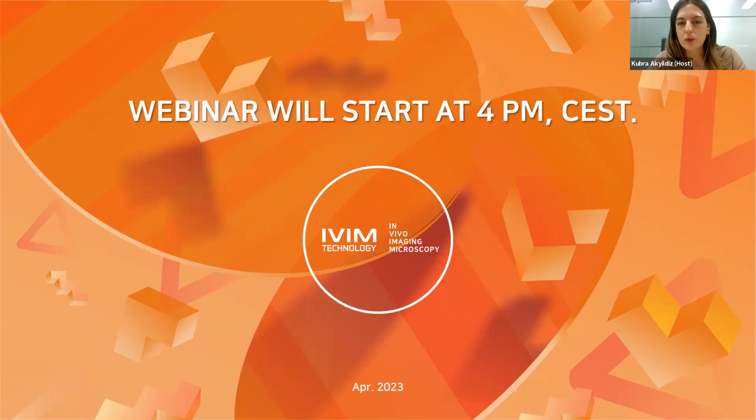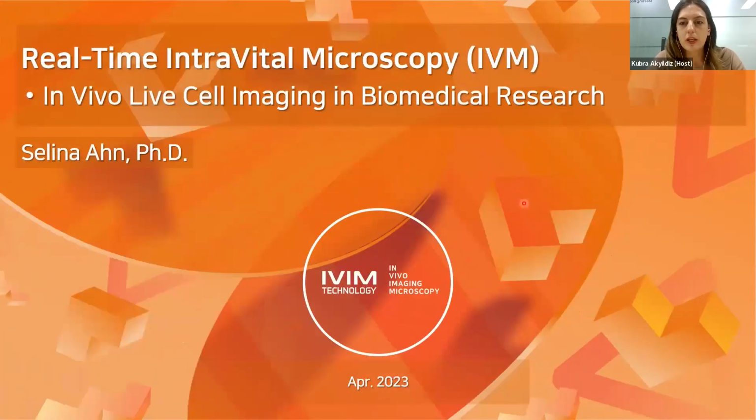Today's presentation will be about the latest technology in live animal imaging, real-time intravital microscopy for biomedical research. It will be presented by Dr. Selina Soyeon, and during the webinar, if you have any questions, please use the Q&A box below. We will also answer some of the questions sent prior to the webinar.